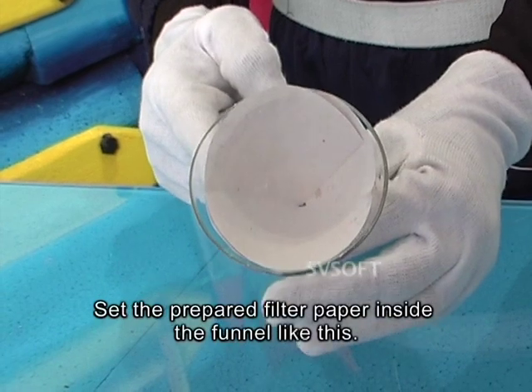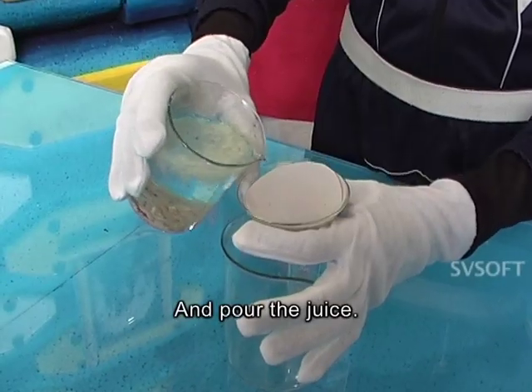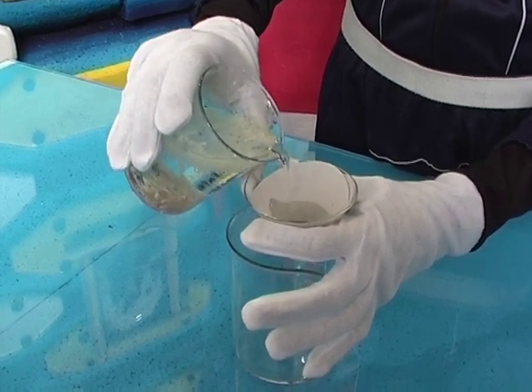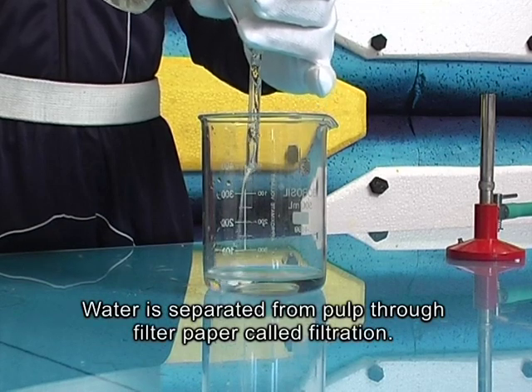Set the prepared filter paper inside the funnel like this, and pour the juice. Water is separated from pulp through filter paper, called filtration.